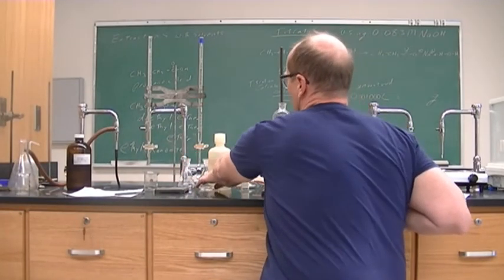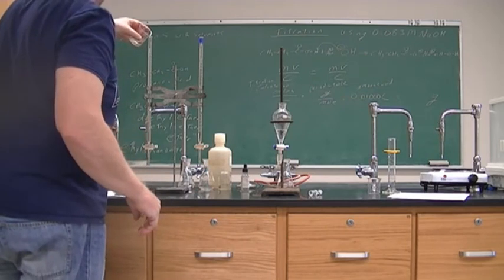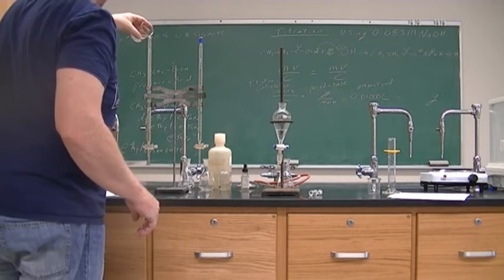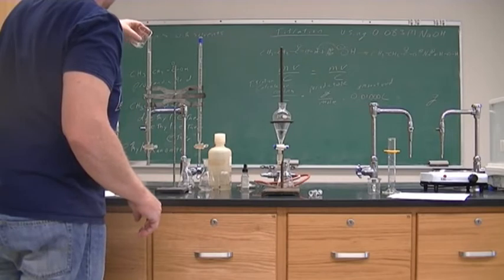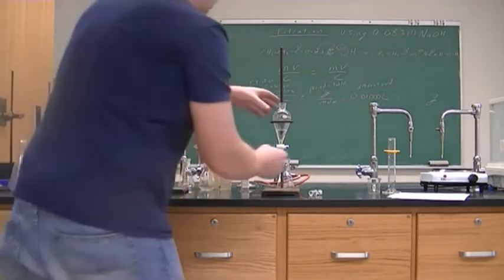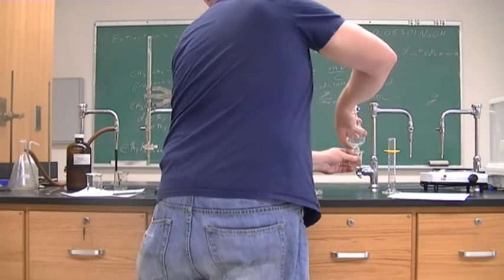This time we're going to put our acid, and I guess we don't need to go too much. Let's figure out our ether.